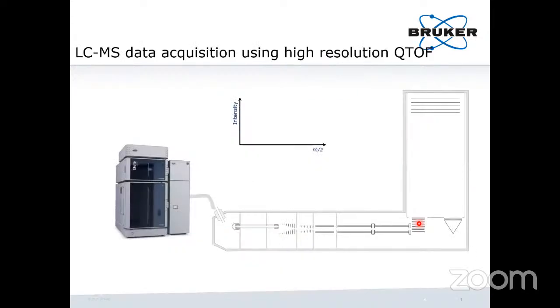This is just one example I want to explain, the QTOF. As I mentioned here, this is the inlet. Here I have taken LC as a front end. This is the inlet, ESI. A glass capillary tube is there, where your ions will move through. Funnels will be there, where they will focus your ions. When you are spraying, automatically as a sprinkle, your ions will move here and there. When you have these funnels, you may cover them completely, which gives a chance for sensitivity.